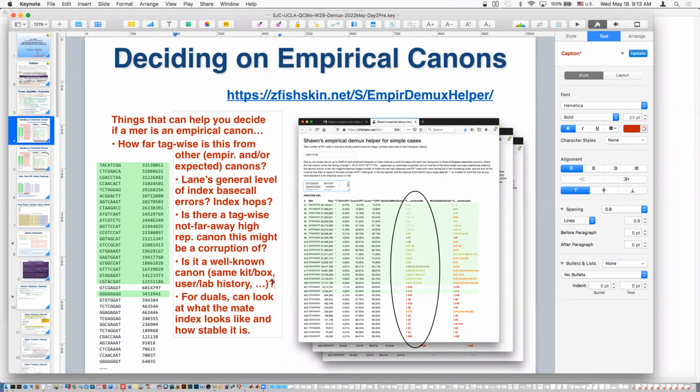So if somebody used Illumina UDIs and intended to mix 48, 49, from a list of 96 or whatever, 48, 49, 50, and 51, but the list also empirically has 52 and 53, that sounds like they're real, that's not much of a coincidence. It sounds like the right next ones in the list. But even if it was like 3, 4, and 5, which are further away, they're still in the same kit as the others.